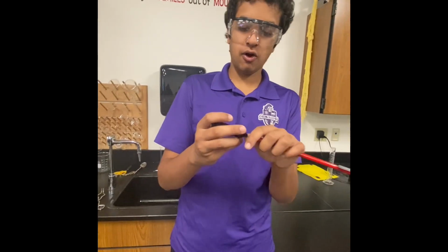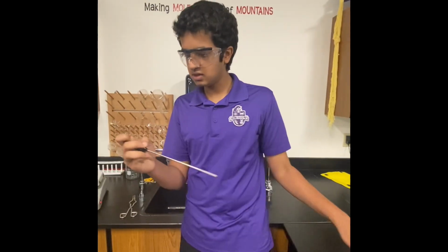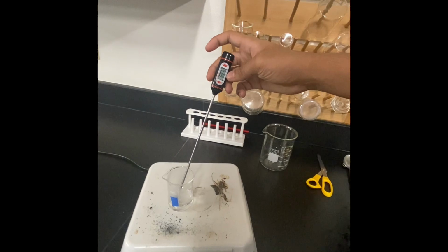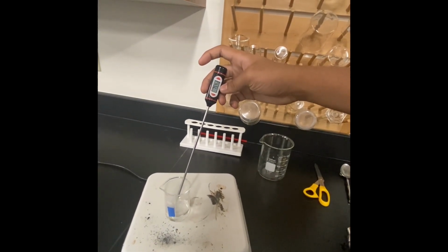We want to calibrate our thermometer to make sure this is not a boil. So we're going to first zero it out, and put it on Celsius. Here we go. I'm going to insert it and measure.